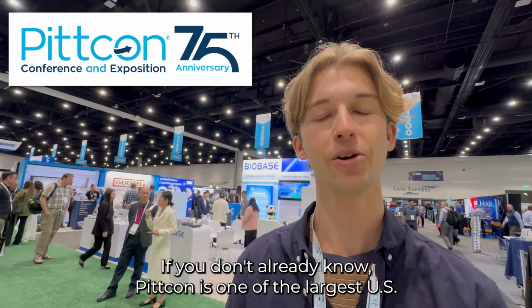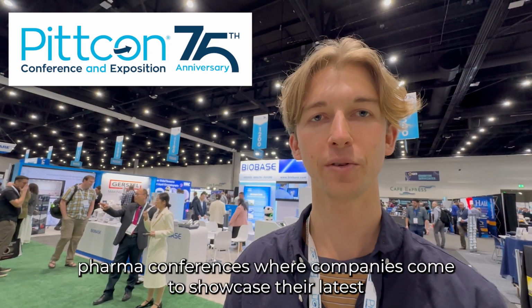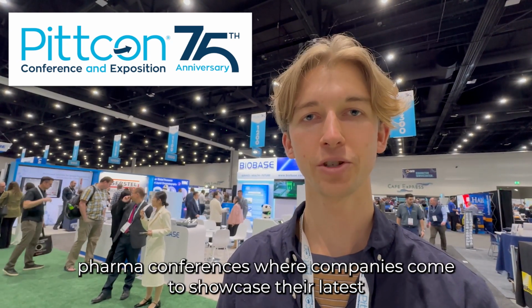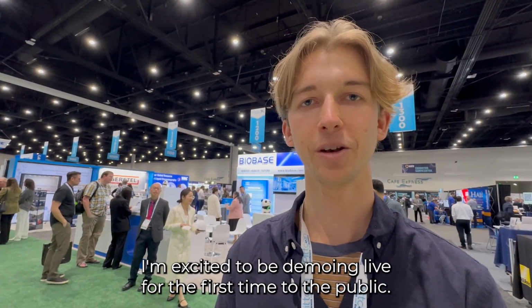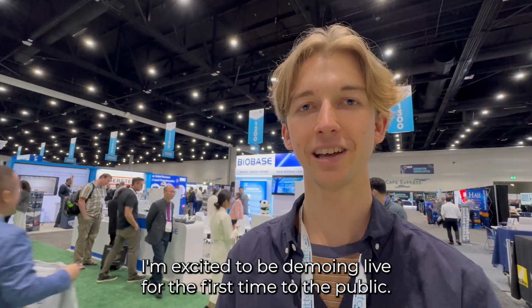Today, I'm live at Pittcon in San Diego. If you don't already know, Pittcon is one of the largest U.S. pharma conferences where companies come to showcase their latest advancements in laboratory science technology. Right now, from the floor of Pittcon, I'm excited to be demoing live for the first time to the public Phizzle's new solution, Digital Air.